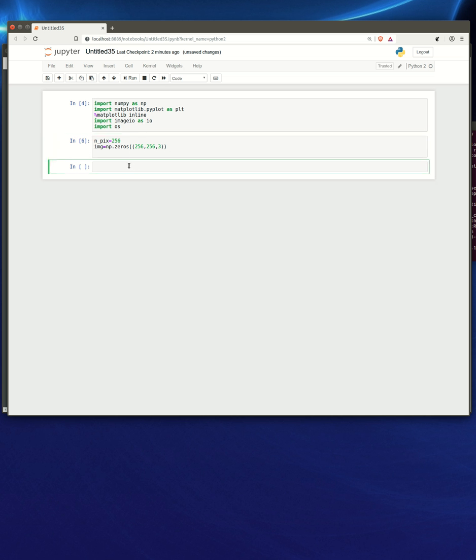So the first thing that we want to do is to set up elliptical objects in our data. The most important message in how these datasets should look is that there should be some amount of variability in the shapes that we create and in their color code, in order to give the Cycle-GAN a lot of variation to work with, to map the features that we created onto the actual objects that we want to detect, which in this case are the cells.